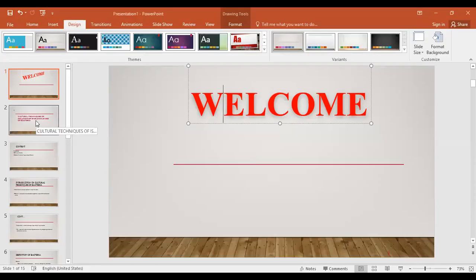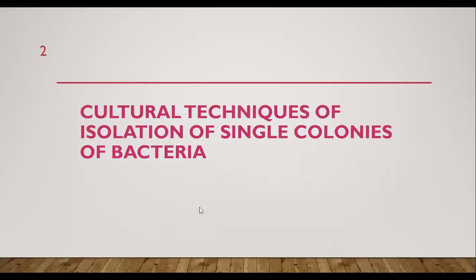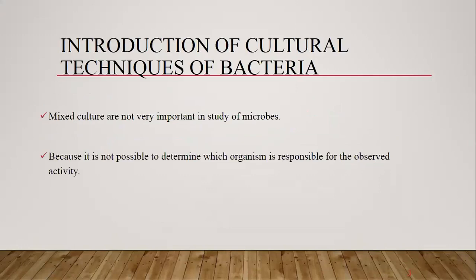So, welcome to all. Today's topic is culture techniques of isolation of single colonies of bacteria. First, in this lecture, we are going to discuss the introduction, what is meant by pure culture, then what is meant by bacteria, then what is meant by single colony, and what are the methods of isolation of single colony of bacteria.